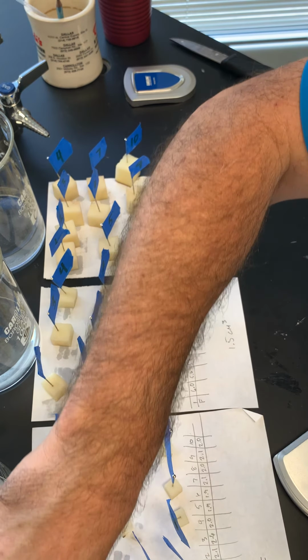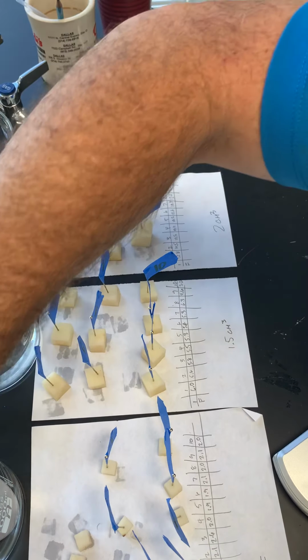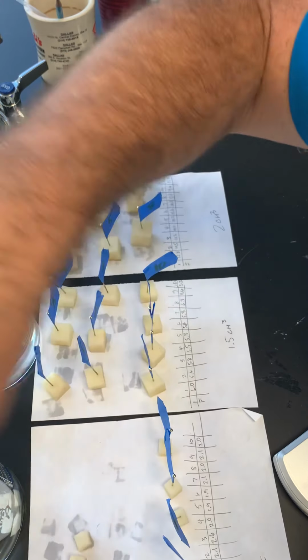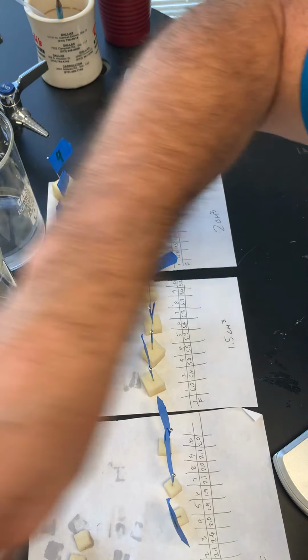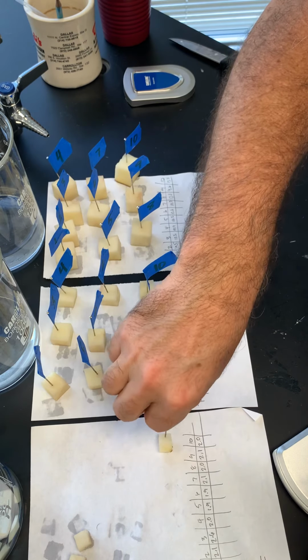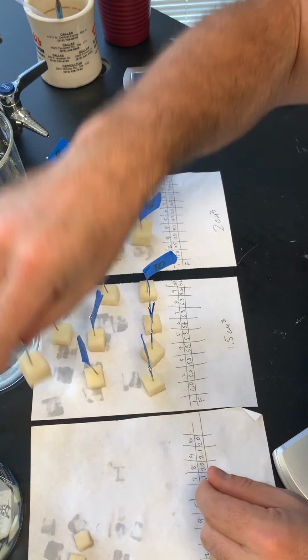So let me go ahead and place these guys in here really quick. Be really gentle with them. And I'll take them out first. When I end the trial, I'll take these out first to control for the situation where they might have been in a little longer. Well, I'll take them out first. These guys won't be in any longer or shorter in terms of their trial time.